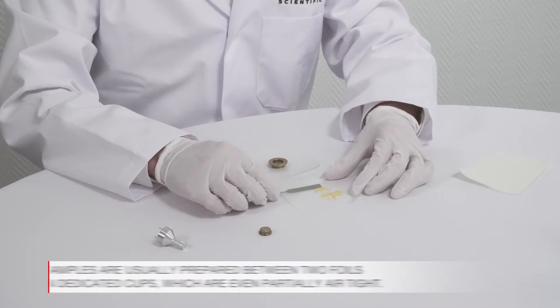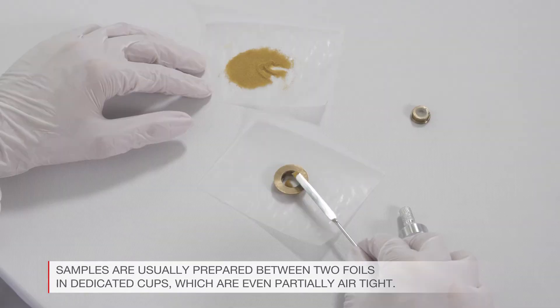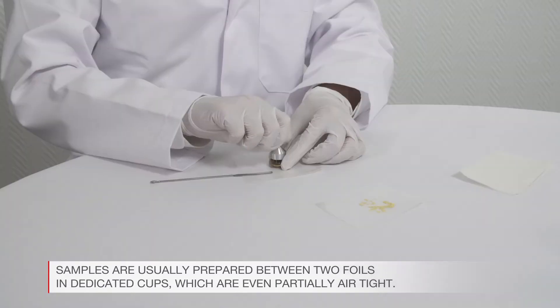Samples are usually prepared between two foils in dedicated cups, which are even partially airtight.